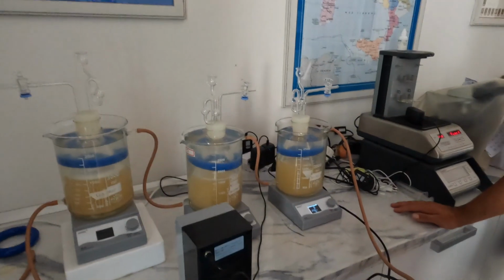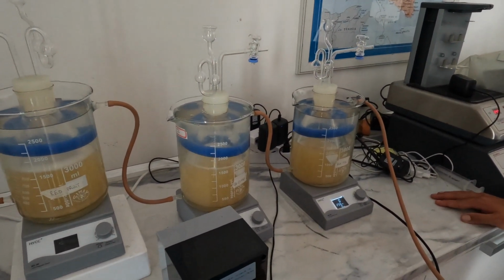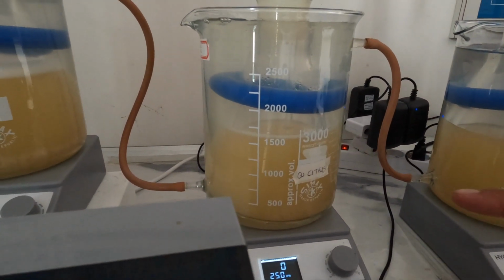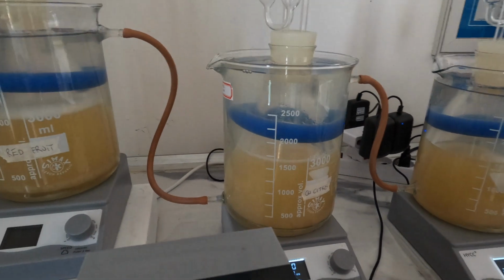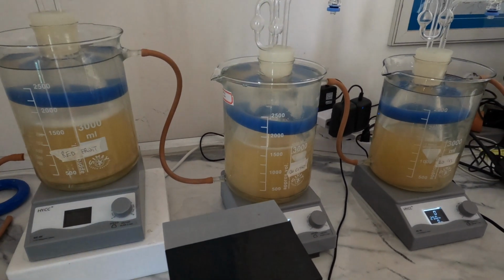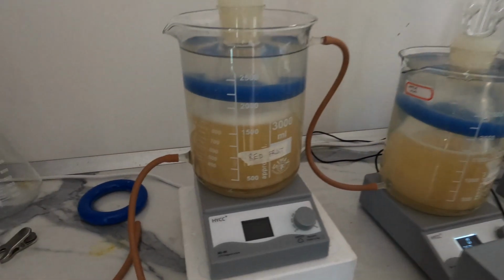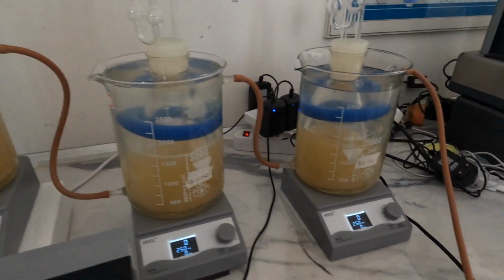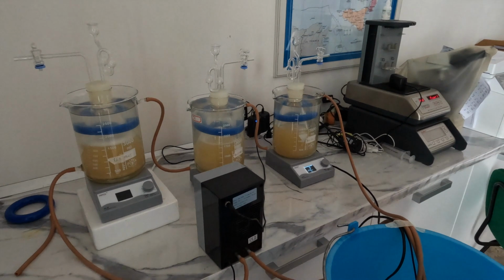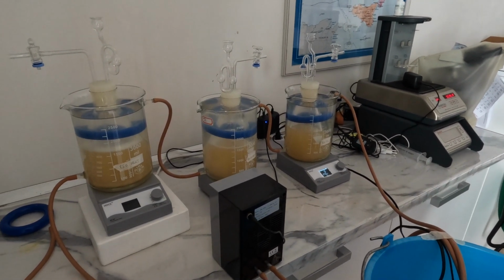All right. So Rocco was telling me from his analysis so far, he has established that Citrus is the best yeast to use for this particular batch because it has a fast fermentation rate compared to the other two, the Red Fruit and the ES 1081. So that is what they are going to be using to get the level of alcohol that they need for the wine that they're making.